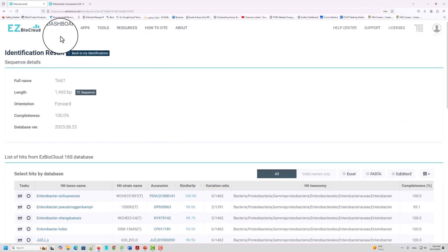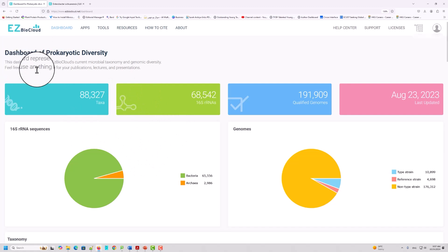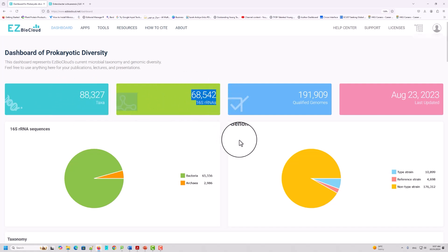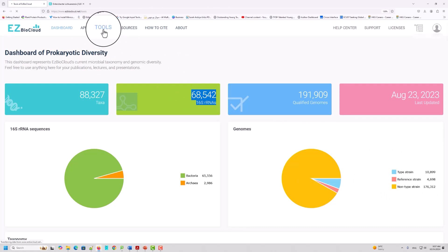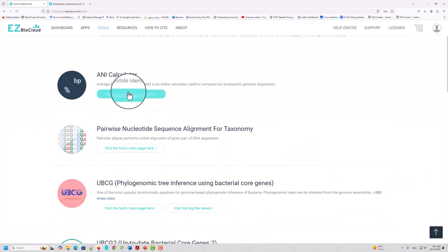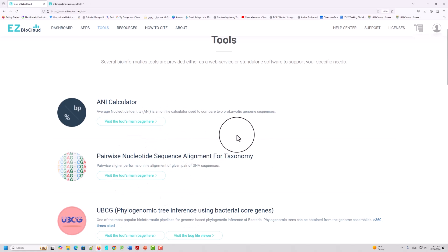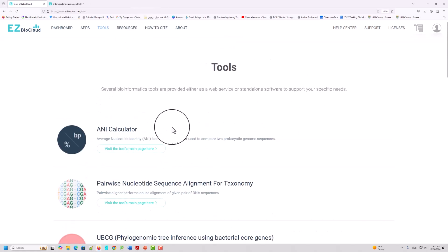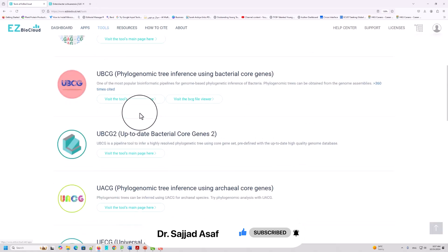In the next class, we will talk about some other features of EzTaxon, like how to compare whole genome databases. If you come to the dashboard of this database, you can see how many taxa, ribosomal RNA genes, qualified genomes, and reference strains there are. There are also multiple tools here, such as the ANI calculator — the Average Nucleotide Identity calculator — for comparison between two bacterial genomes.